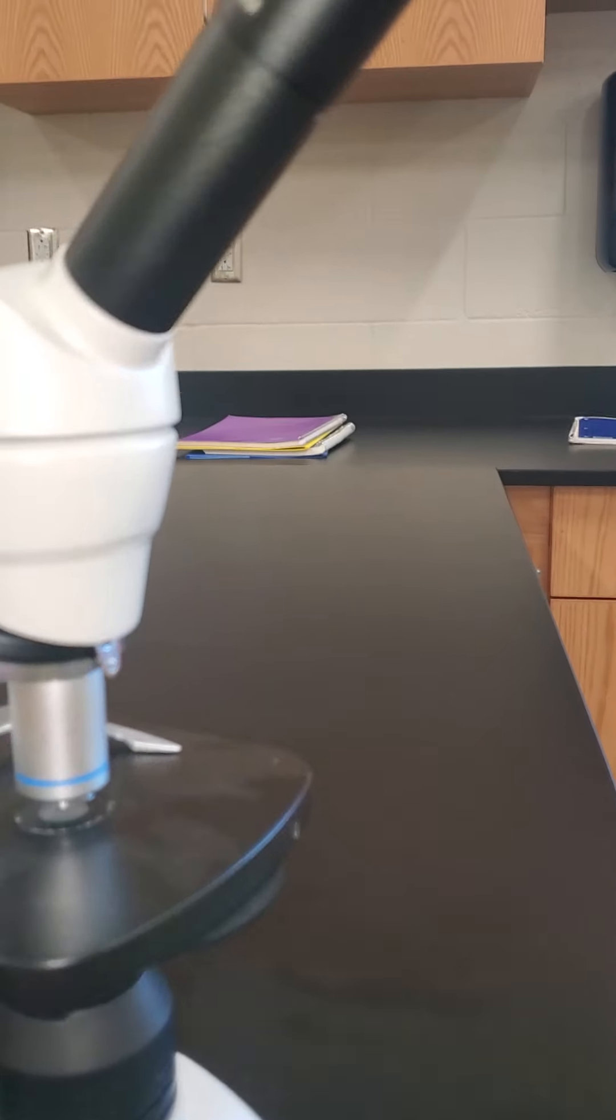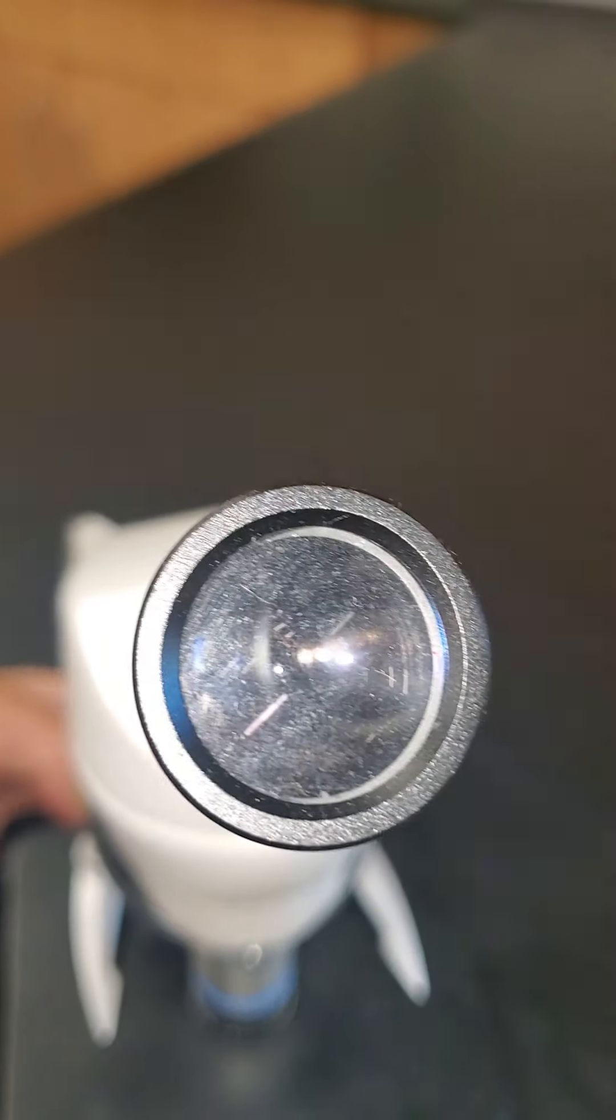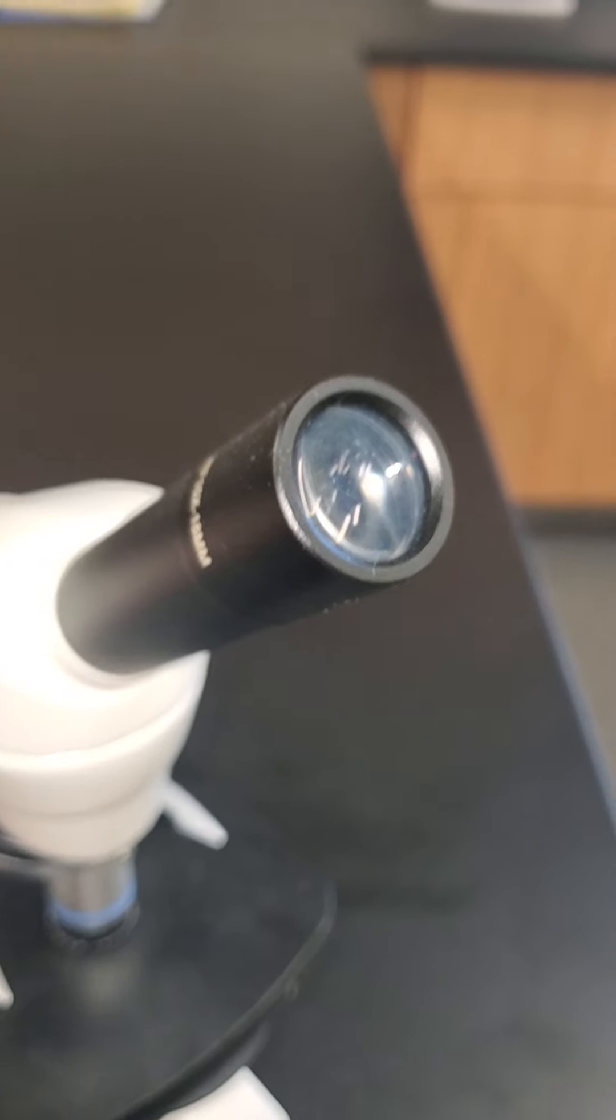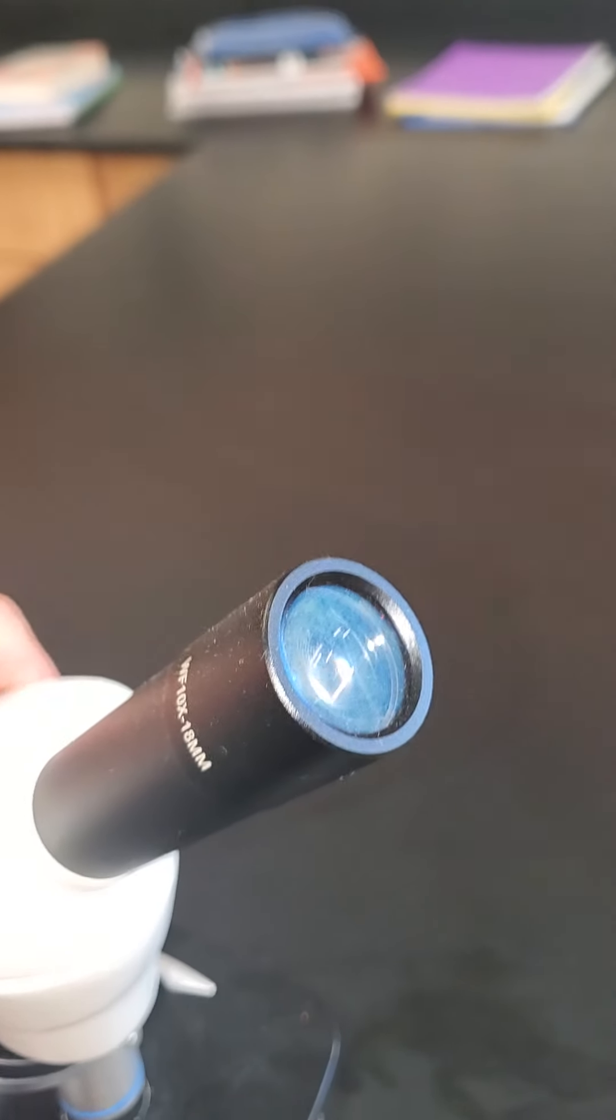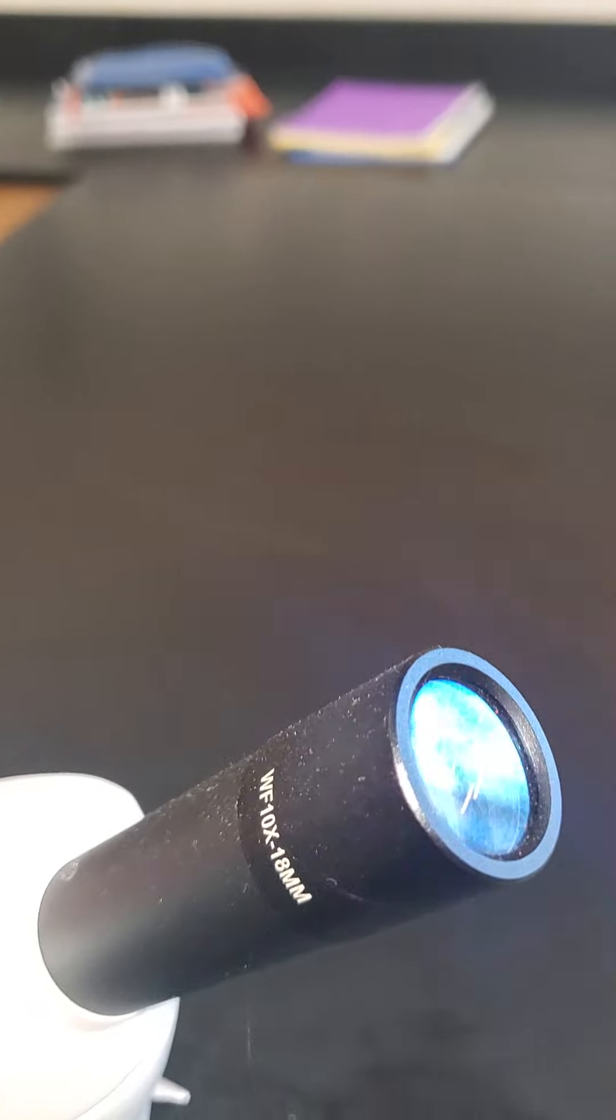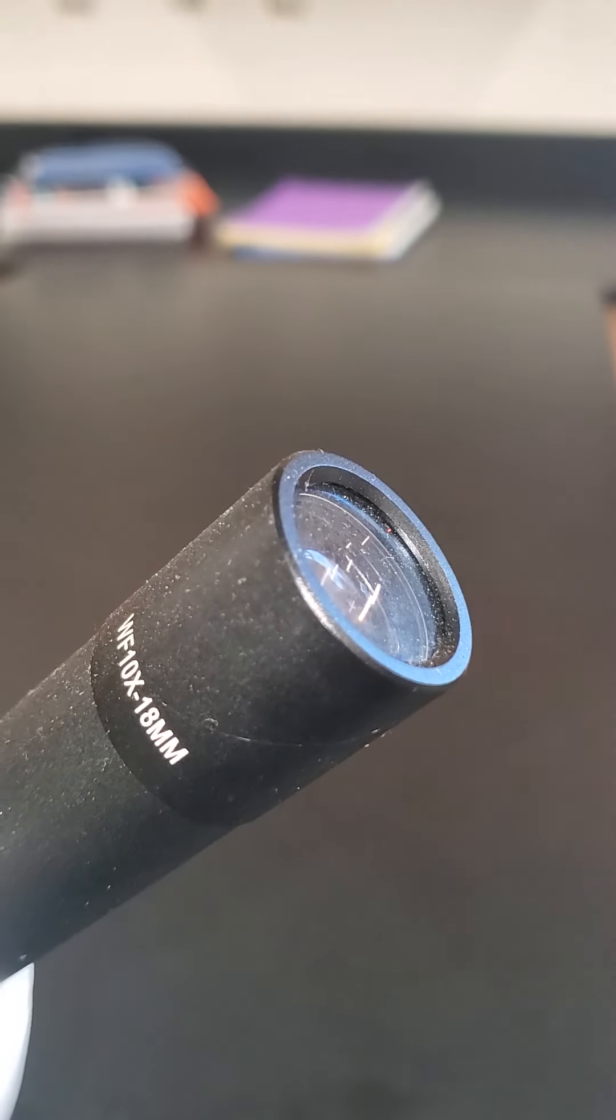This is your eyepiece up at the top, that's what you are able to see through. I'm trying to get the line on here so you'll be able to get your eye right up to that lens and see right through it, but of course my light is reflecting. The eyepiece also magnifies another ten times, so we get extra magnification from the eyepiece.